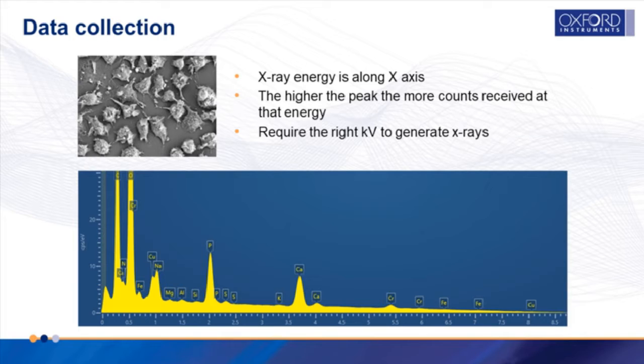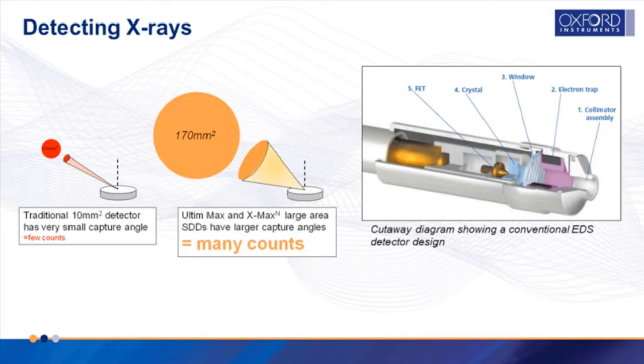It is important to use an EDS system that is sensitive enough to not only detect light elements, but software that can deconvolute peaks when they overlap each other, such as Aztec. Determining your microscope operating conditions by what elements you expect to see in your samples is extremely helpful when planning your experiments. An important part of EDS is detecting as many of the X-rays as possible.